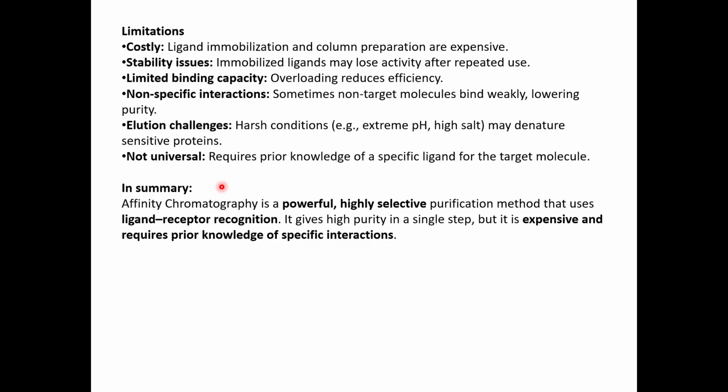So, like I said, if it's a completely new sample out of the blue, where you want to find out whether your particular target of interest is there or not, but you don't know what you want to elute, or you don't have complete information of your target and its binding capacity to your ligand, and you don't know what other components are present in your sample which might or may not interact with the ligand you have chosen, that might become an issue.